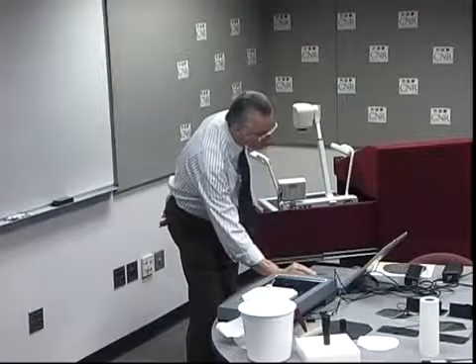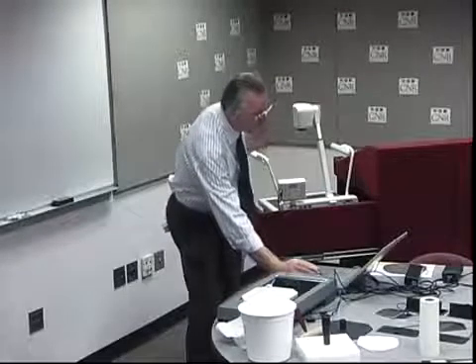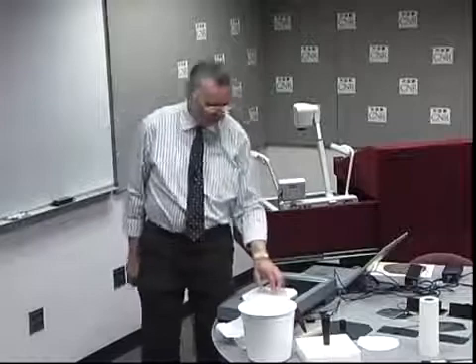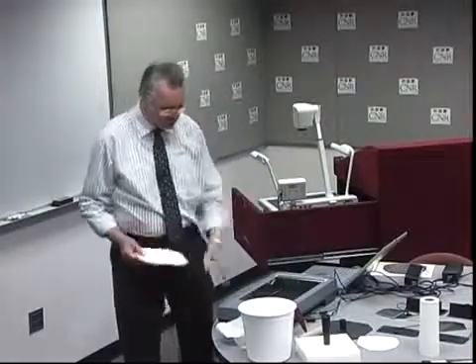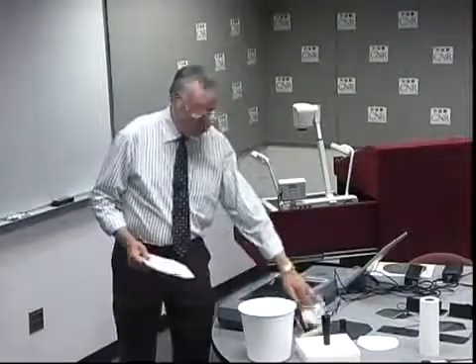There is nothing else to tell you about it. It runs very quickly and very easily. Just run from the wet handsheet for process control. Bill, I think we're finished with the stickies measurement.